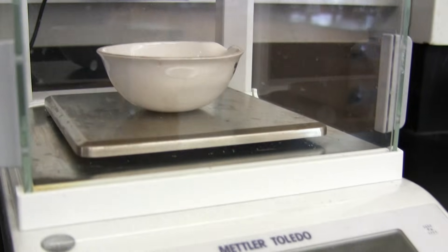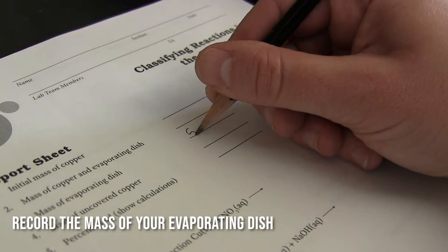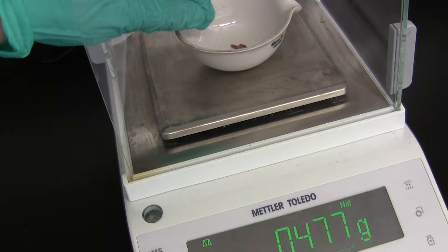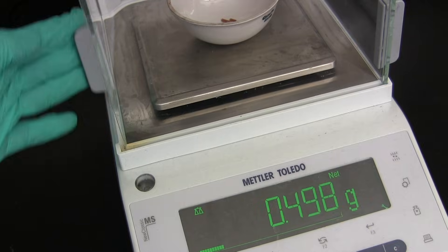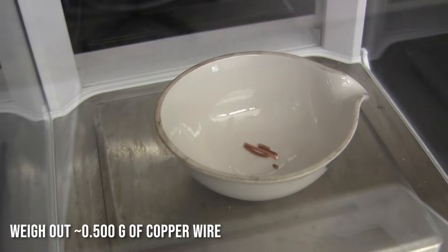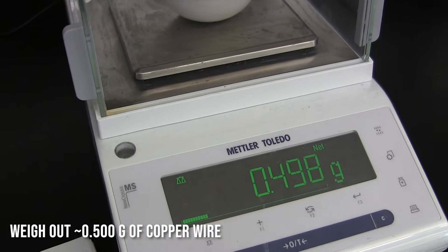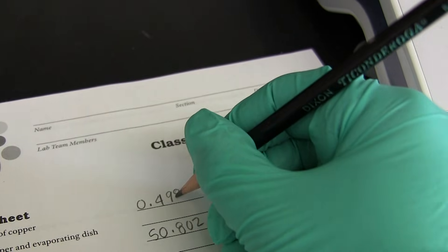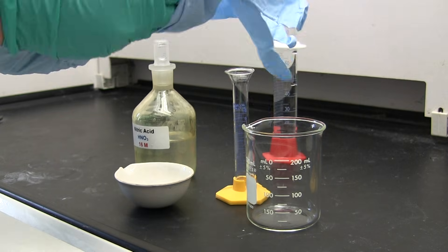First, you're going to want to take the mass of your evaporating dish. Make sure you record that in your lab notebook. Now we are going to measure out close to 0.5 grams of solid copper wire and record that number as well. Make sure you do not forget this step.